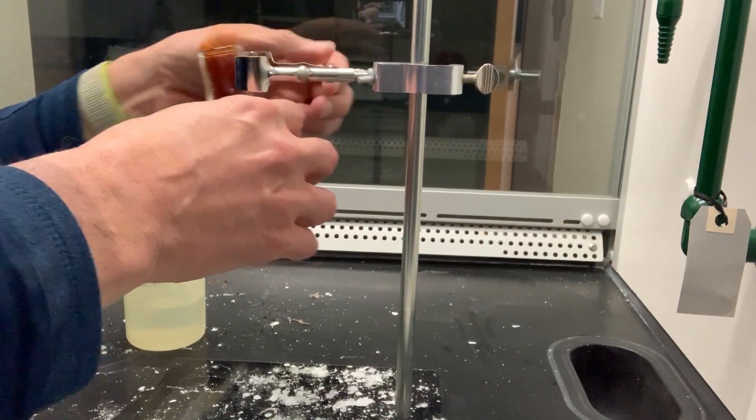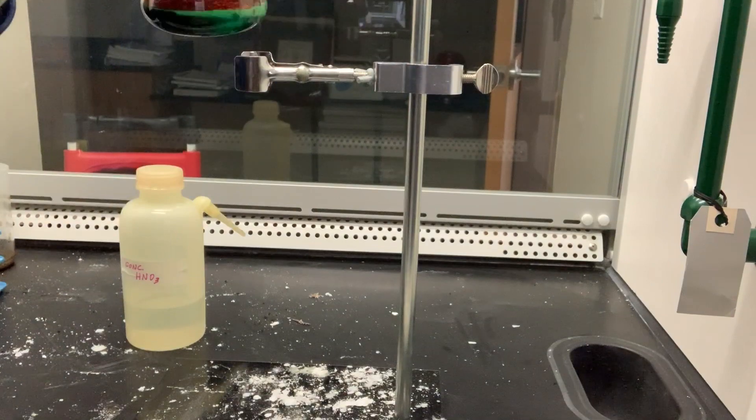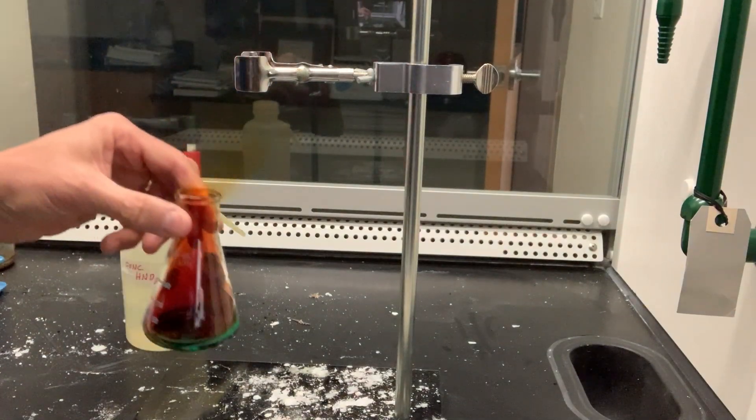The bluish-green solution produced at the bottom of this flask is copper(II) nitrate. Let me show that to you. You can see that.